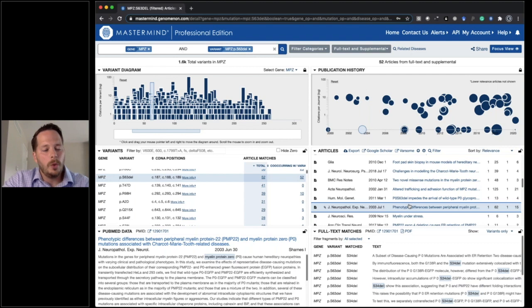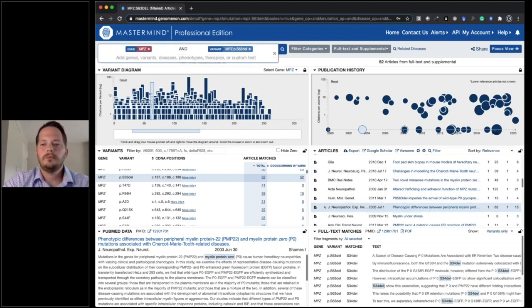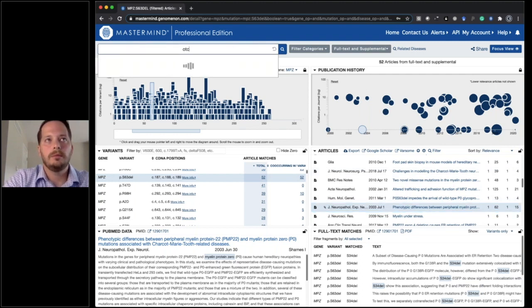and disambiguated it and put that result in and amongst the rest of the S63del descriptions for maximal sensitivity, based on our awareness of the legacy nomenclature issues for this protein. So that's the fourth example.